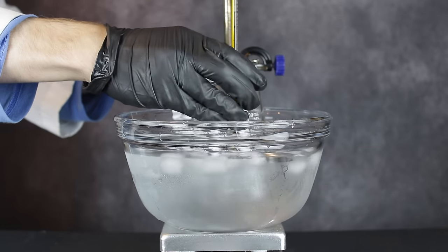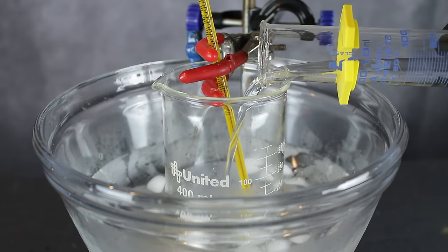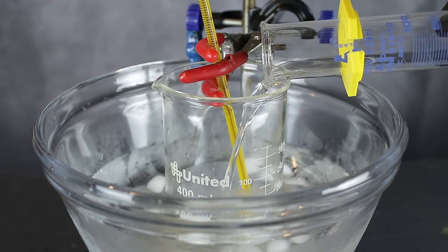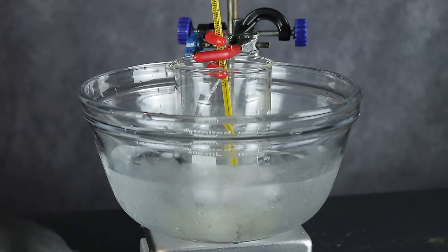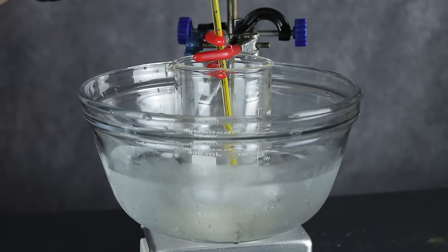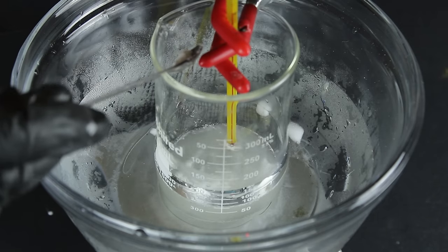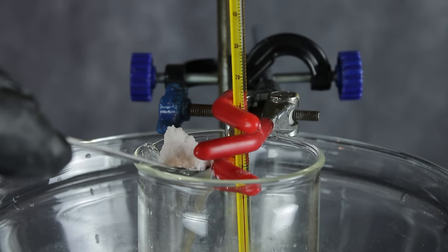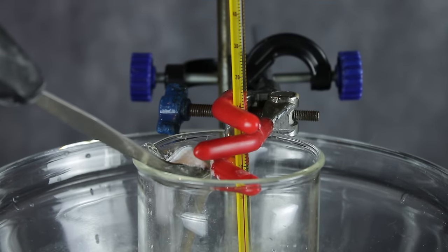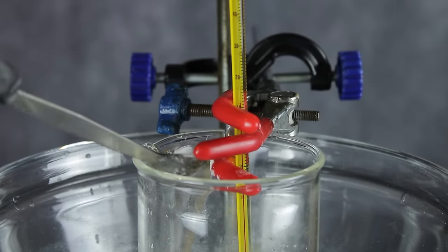To start, a 400 milliliter beaker was placed into an ice bath and filled with 52 milliliters of concentrated sulfuric acid. Once the acid cooled down to about 15 degrees celsius, 30 grams of urea was added at a rate slow enough to keep the temperature below 25°C. It's best for the urea to be a fine powder when you do this, since the large crystals that come straight out of the bag take forever to dissolve.